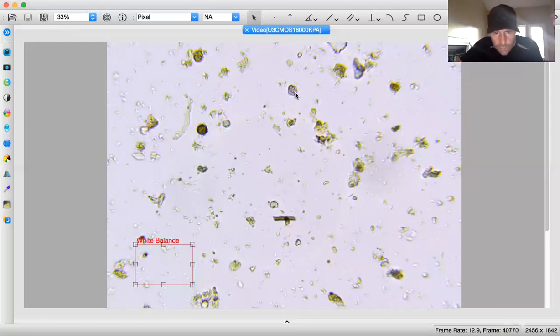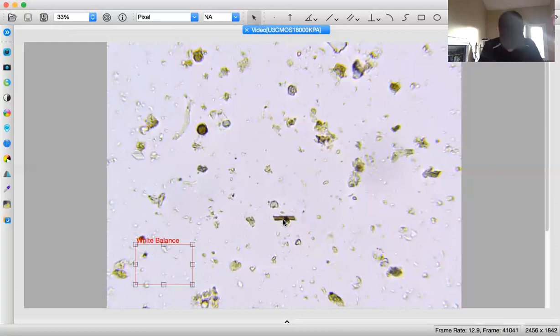I'm gonna do this fungi here. Again, we're gonna call it a 0.05, and it looks like approximately, I want to say 3.5. That's 1, 2. I want to say 3. I'm gonna call that 3 micrometers.